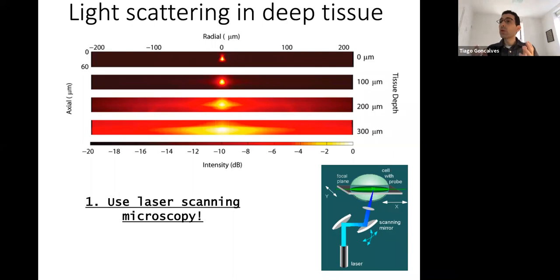And in fact, when you do in vivo two photon imaging, sometimes if you have a really strong sample and you go in the dark, you go under the microscope and you see a little green glow. If you have a mouse that expresses a lot of GFP, you see the green glow. That green glow, you can even put a sensor there on the side of the mouse. It doesn't even need to be through the objective. The objective is only needed to excite here. How you detect doesn't matter. You can detect from the sides, you can detect whatever green light there is in there.